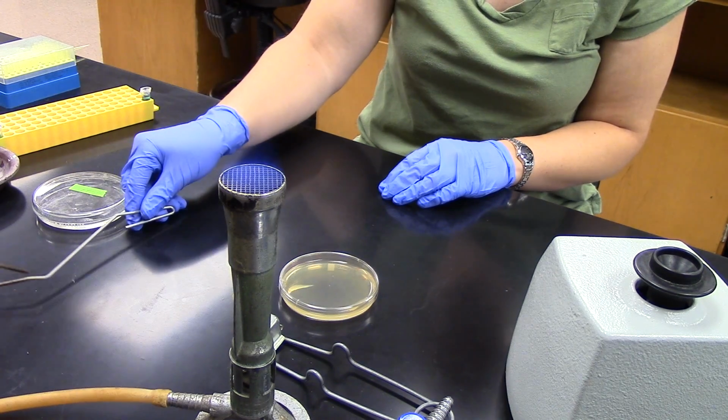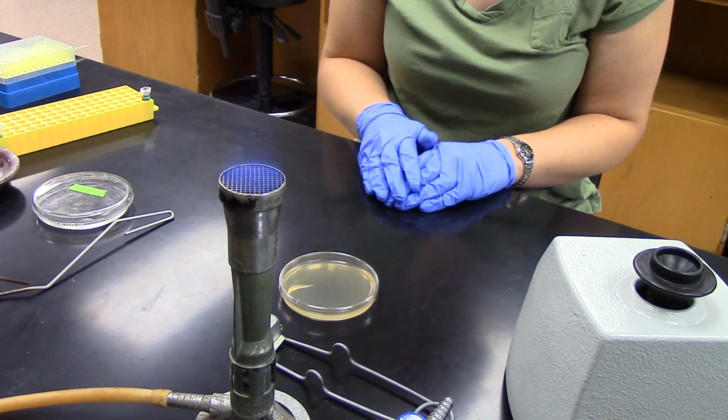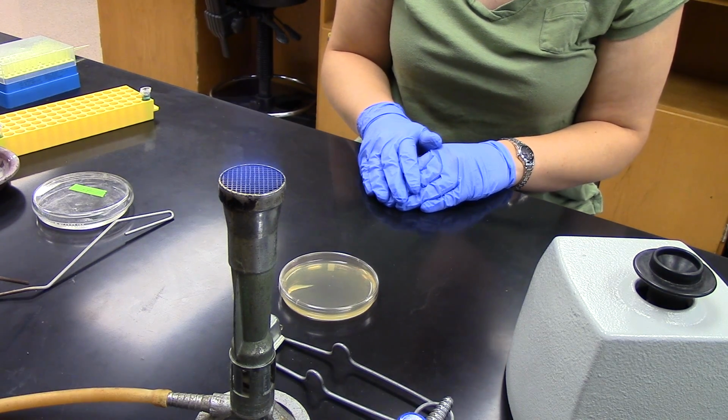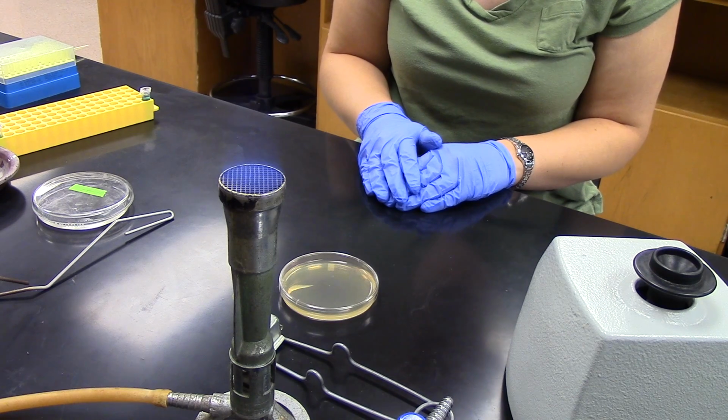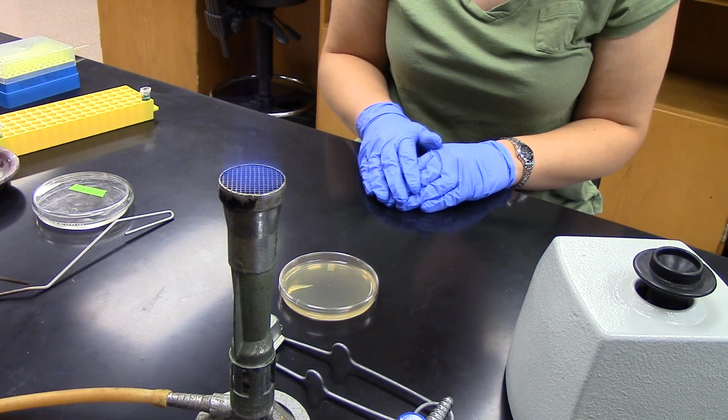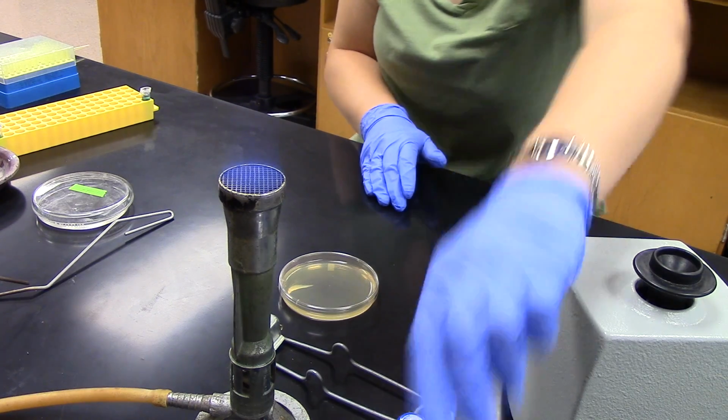And if you flame it and then you feel like you need to sterilize again for whatever reason, it touches something maybe and you think it might be dirty, don't put it directly into the alcohol when it's hot. You could set your alcohol dish on fire. Okay, so I think that's it. Just remember to always turn your Bunsen burner off and clean up your area when you're done.